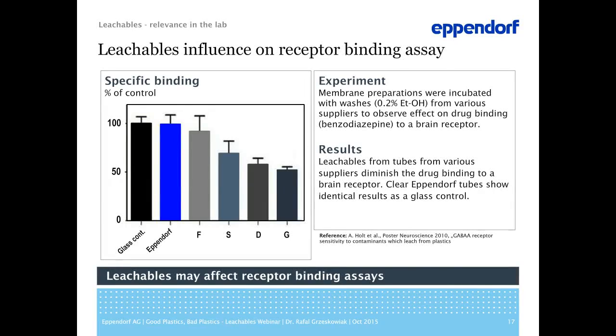So the second example shown here investigates effects of leachables on a receptor binding assay, which is one of the most commonly used assay systems in pharmacology and drug discovery.